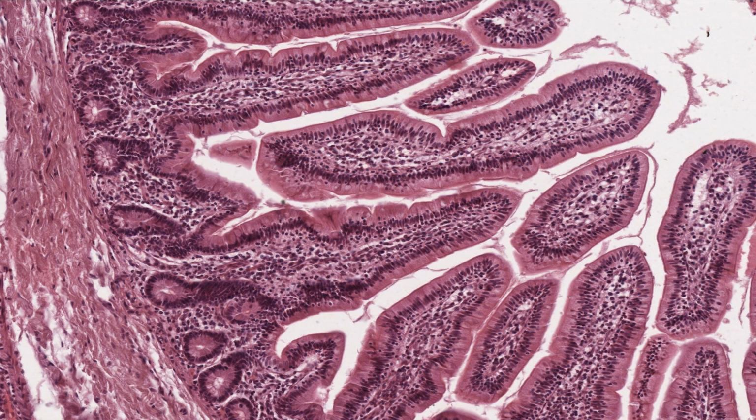Lymphocytes are the predominant immigrant cells, but there are also eosinophils, macrophages, and plasma cells. Don't worry about sorting out these cell types. For now, just note the abundance and diversity of cells in this connective tissue.